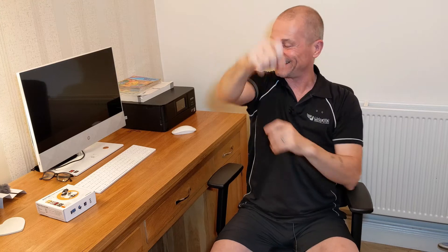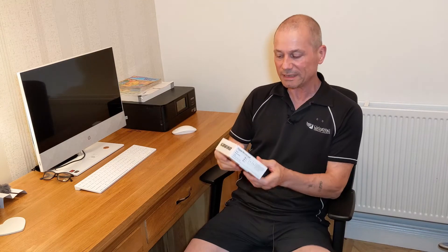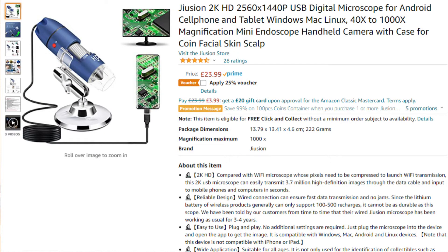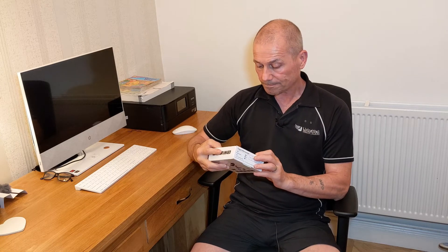I've always wanted a macro lens to take pictures of flowers close up and look at fly heads and stuff. The price of macro lenses for cameras is ridiculous, so I bought a digital microscope instead. It cost me £23 and it's supposed to be 2K - not 4K, not 1080, 2K. Don't ask me why 2K, but that's what it is.